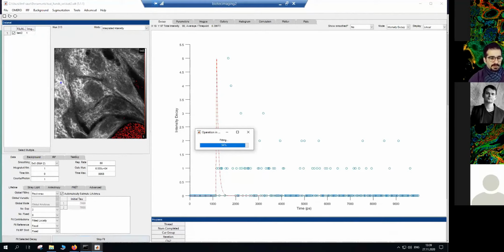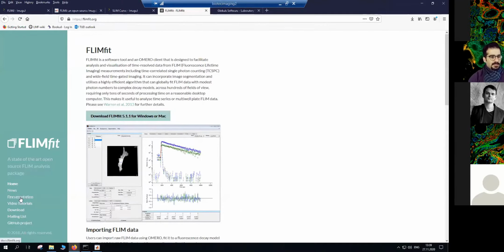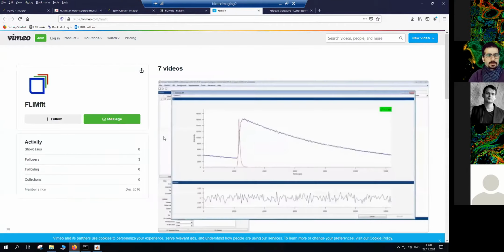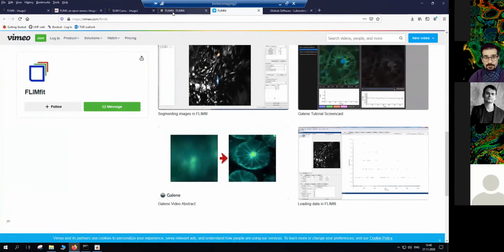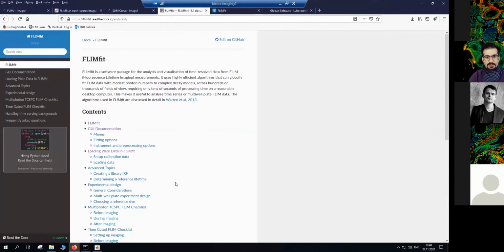The good thing here is that when you go to their website, you can go through the video tutorials. There are few, but very informative. What you find in these 7 videos is quite enough for anybody to start. And another one is the documentation, which I learned a lot from. Not only how to work with FLIMfit, but in general about FLIM itself.